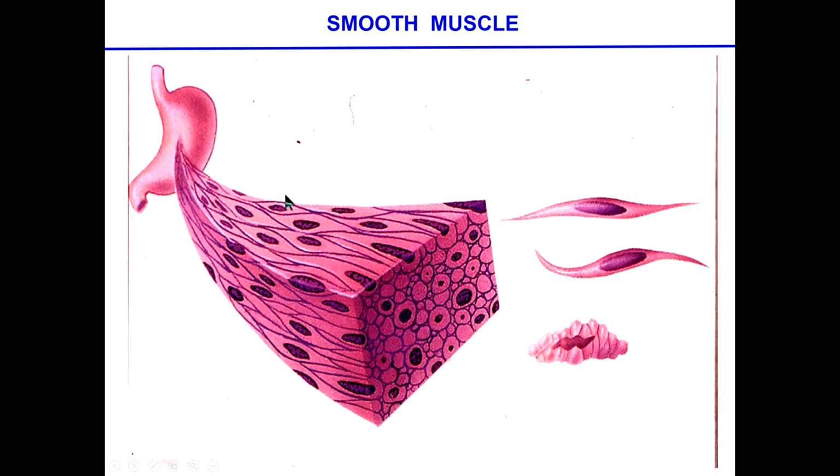Typical longitudinal section indicating these spindle-shaped cells with central nuclei. Typical transversal section indicating, of course, if you've been lucky enough, some of the cells will show the nucleus. In any case, it will be centrally located, and it will take more or less space within the circle of the cell, depending on where in the cell you actually perform this section. Right? Questions?